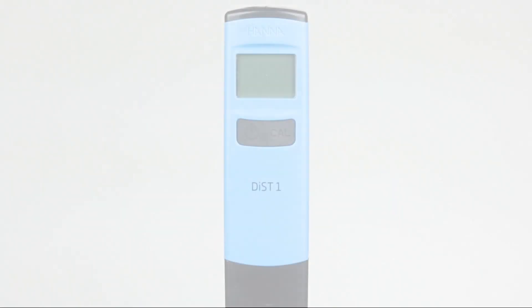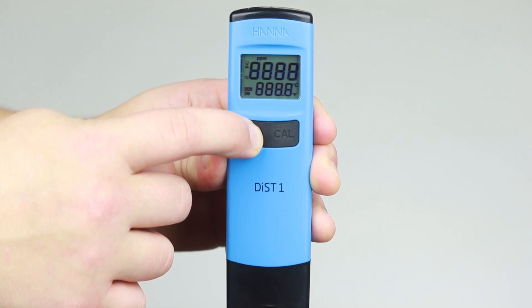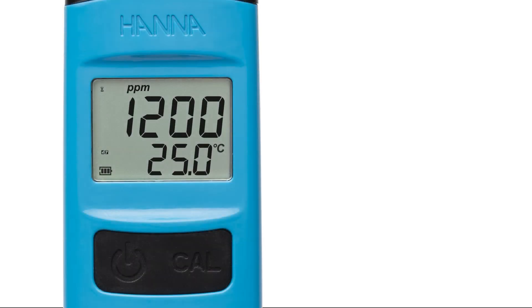To operate the meters, simply press the left on-off button to turn on. All the LCD segments are displayed. Then the battery percent level is displayed, alerting the user to the remaining battery life. In operation mode, the following can be seen.